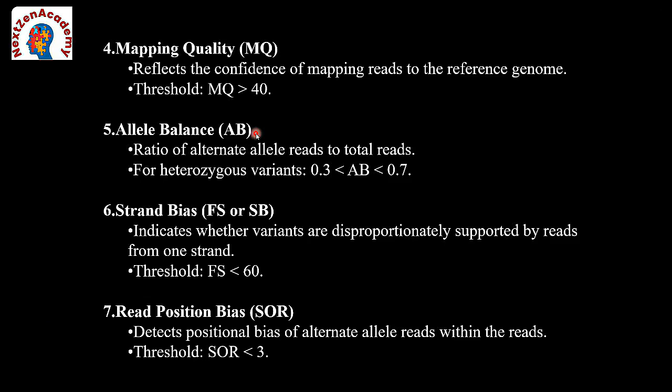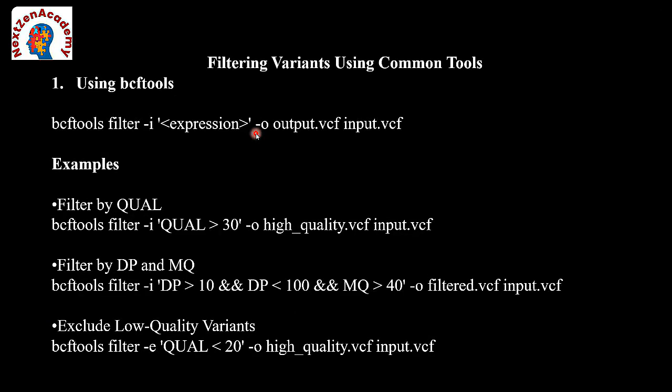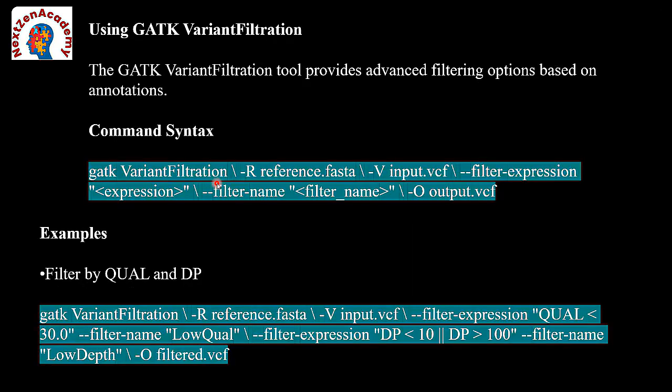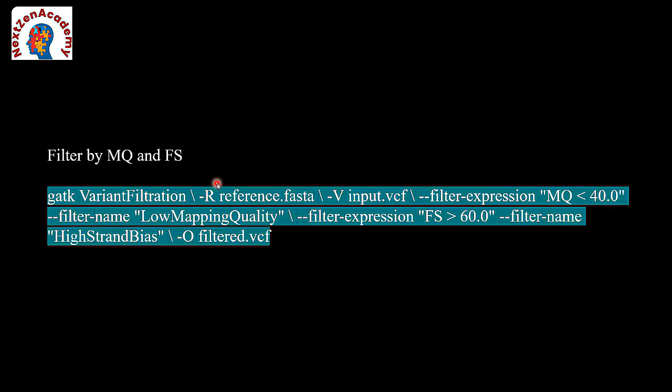So we use bcftools view -r chromosome 1 from this position to this position, and then in the input file here we can extract that data alone into the output VCF file. So this can be done through BCF commands, and subsequently we can see the variants.